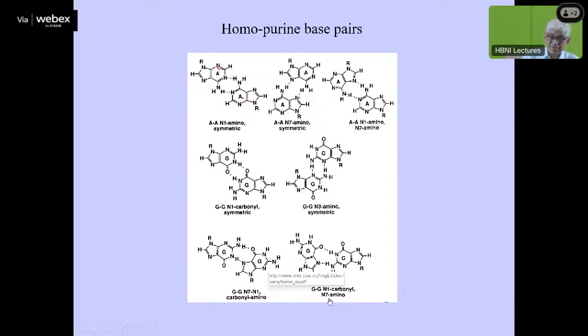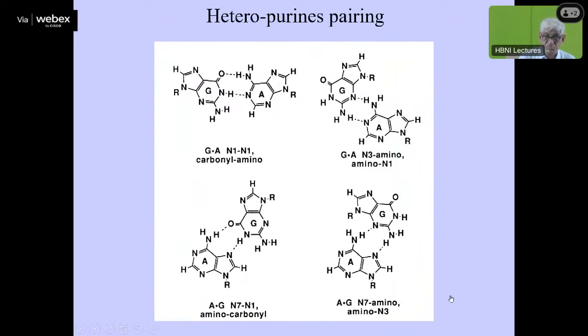When you have to draw these structures out, you will realize that there are so many different possibilities, and one has to investigate in experimental data as to what sort of hydrogen bond is present in your structure. And that you can only do when you understand the individual possibilities, the nomenclatures, and the signals of the individual protons. You have to monitor the individual protons in your structures.